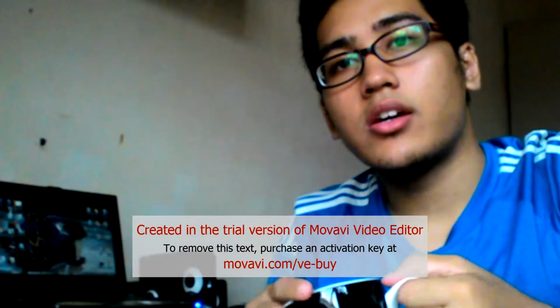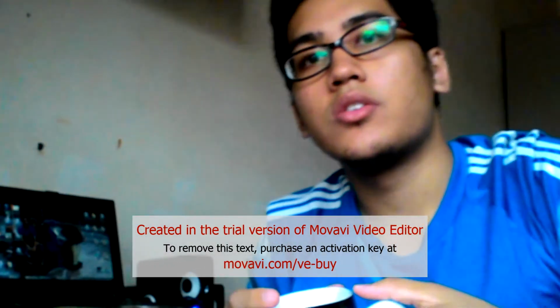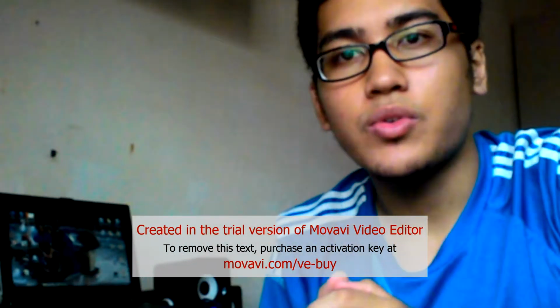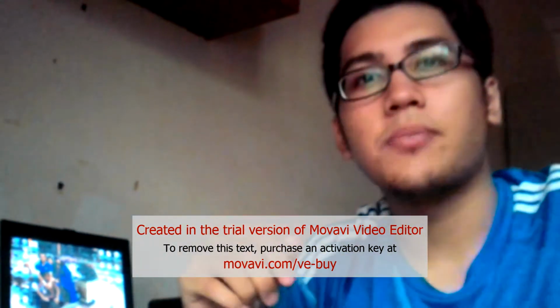Okay, enough about the solar receiver. So now I'm going to touch on the mixing unit. So what is mixing unit? Mixing unit is actually known as bubble column. Now in bubble column, liquid and gas phase occur at the same time in the column itself. So I'm going to show this one video while describing again. Done with the mixing unit.